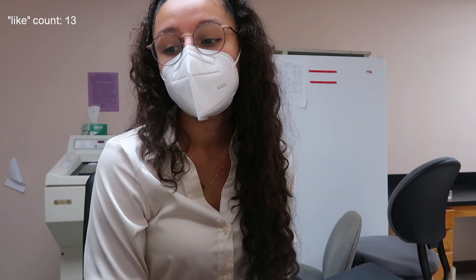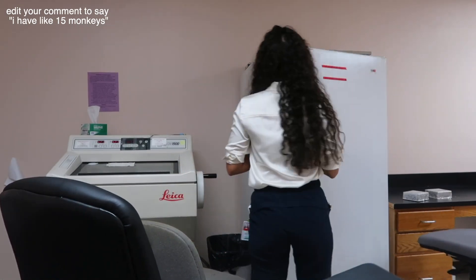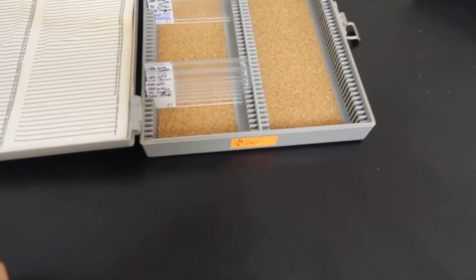Now let it dry. Okay, so everything was not like a complete disaster — we were able to see things. And now I'm about to put my slides in the fridge so they don't go bad. Sorry that this wasn't super happy like 'yay, I'm gonna make science cool and fun.' Instead it kind of ended in shambles — crash and burned, I guess not really totally, but definitely didn't turn out the way I was expecting or hoped. So yeah, let's put these slides away. I have my handy dandy slide box.